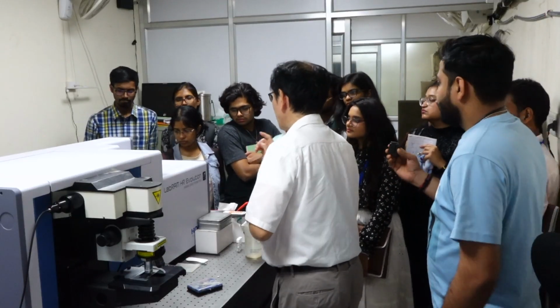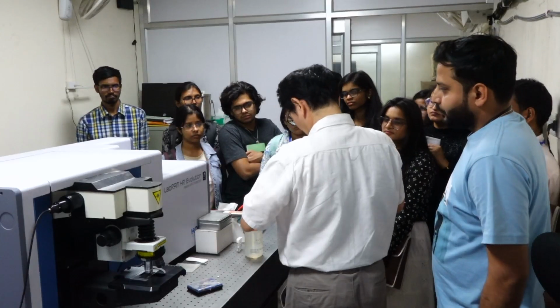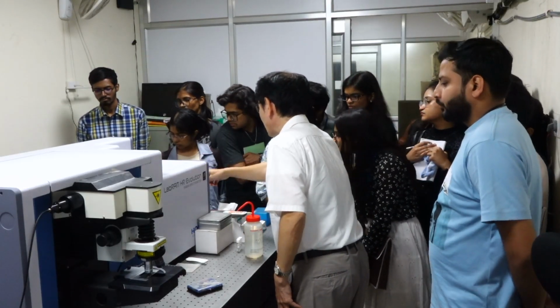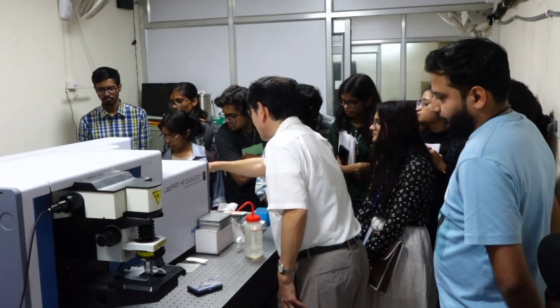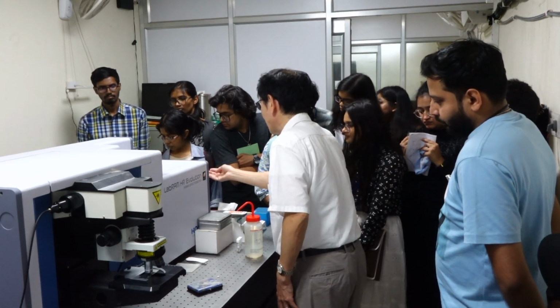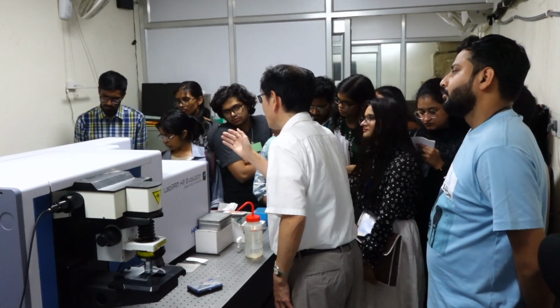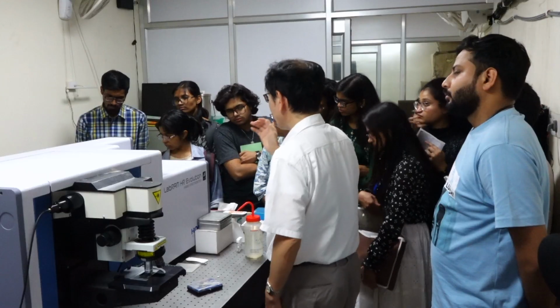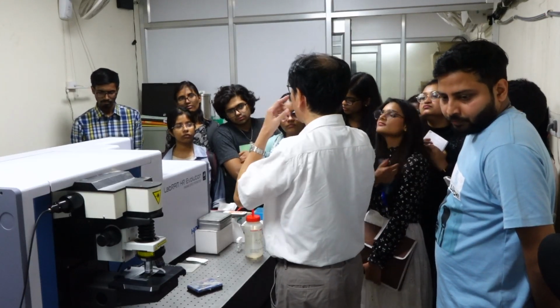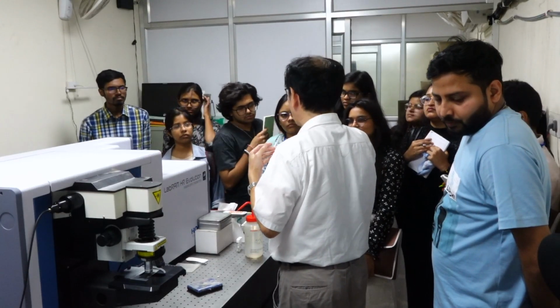So first, the laser light source. The laser light source is over there. From left, 532, 633, 785. 532 is a green laser. 633 is a red laser. 780 is also a red laser. And for safety, when the laser comes into our naked eye, our eye is damaged.